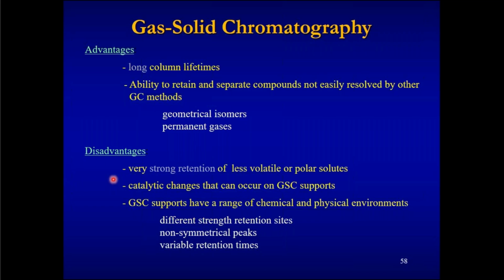The disadvantage is very strong retention of less volatile or polar solutes. The polar solutes are very strongly retained and it's very difficult to elute them, so they will take a long time to elute and your analysis will also take a very long time. The less volatile components will also get adsorbed on the stationary phase, and since they are not so volatile, they will not go into the gaseous mobile phase.